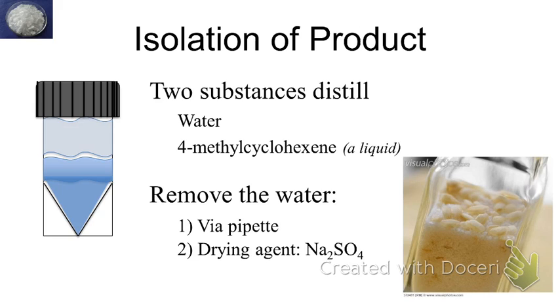There are some people that will keep rice in their salt shakers along with the salt. Why would you do that? It absorbs the moisture. Well, why do you need it to absorb the moisture? What's going to happen to the salt if it absorbs moisture? It starts to get stuck. It clumps up and it forms a big chunk that we can't shake out of the salt shaker. So what we're going to do to remove our water is first pipette, remove the bulk water, the easiest water for us to see, what I would refer to as the visible water. The drying agent's going to take care of the invisible water.